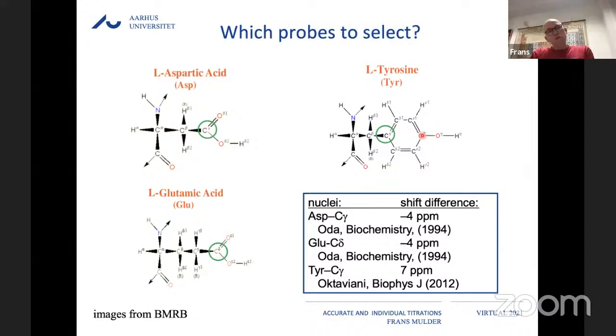Yeah, so of course for NMR spectroscopy, we do deuteration quite often, and it is really possible to get very high deuteration levels for growth in E. coli, and also some other organisms that tolerate these high concentrations of D2O. But in this case, the positions that we're looking at are exchangeable positions. They're labile, so they basically are determined by the solvent. So in this case, it shouldn't be a problem to get them occupied to 100%. Okay, thank you.